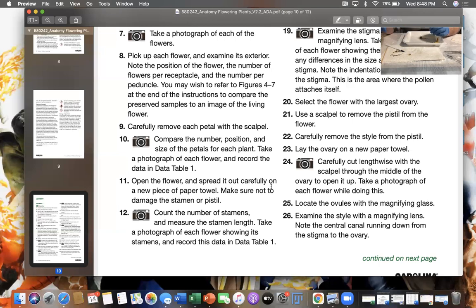Next is the chrysanthemum. This gets a little bit more challenging. Again, I'm going to pin. And for this, I'm going to just simply work with two hands.